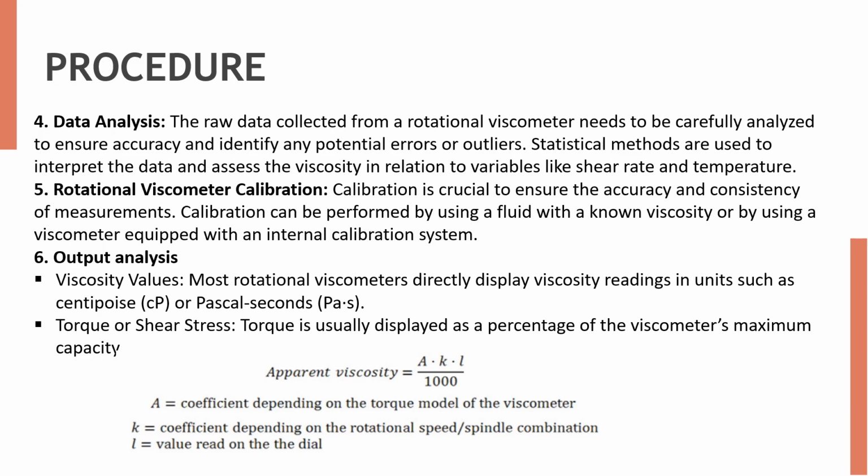Our next step is rotational viscometer calibration. Calibration is crucial to ensure the accuracy and consistency of measurements. Calibration can be performed by using a fluid with a known viscosity or by using a viscometer equipped with an internal calibration system. If we are using an advanced rotational viscometer, then it contains an internal calibration system which eliminates the need to go for a fluid whose viscosity is known.